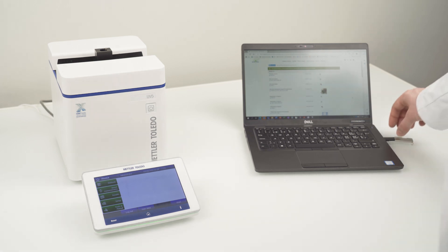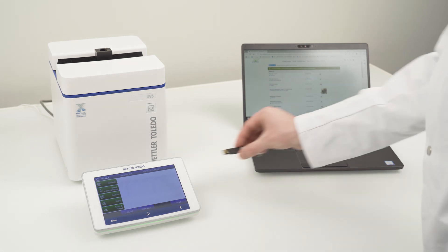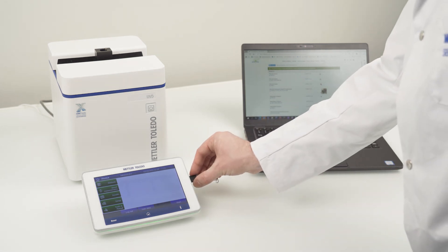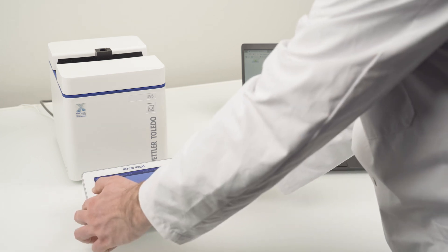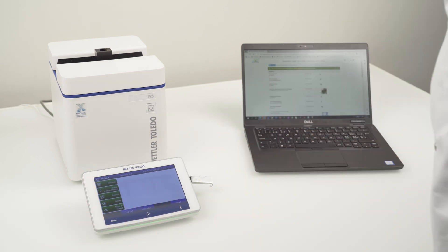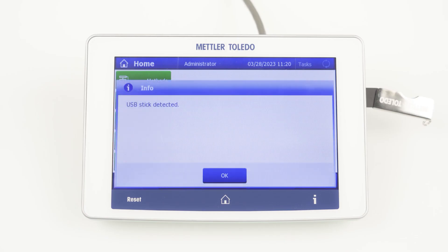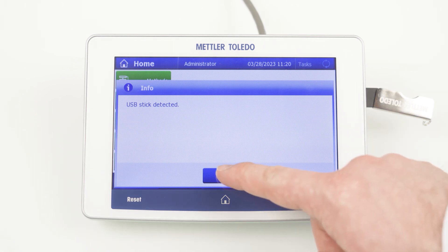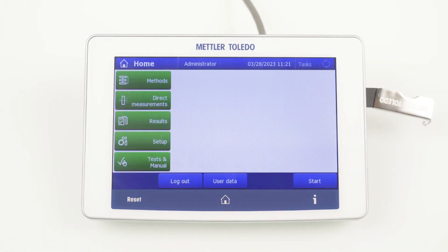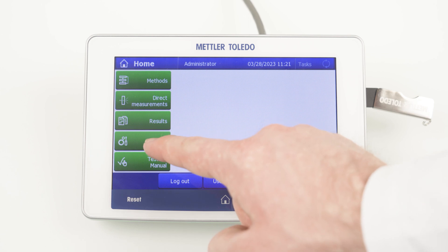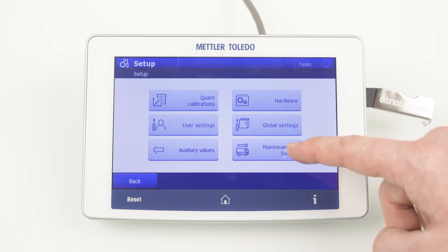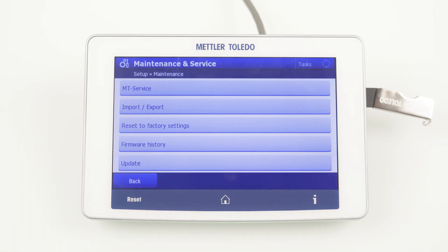Now you can insert the USB flash drive into the USB port of the UEVS spectrophotometer, for example on the right side of the terminal. The instrument will notify you that a USB flash drive was recognized. After you have confirmed the pop-up, you can click on Setup, select Maintenance and Service and then Import and Export.